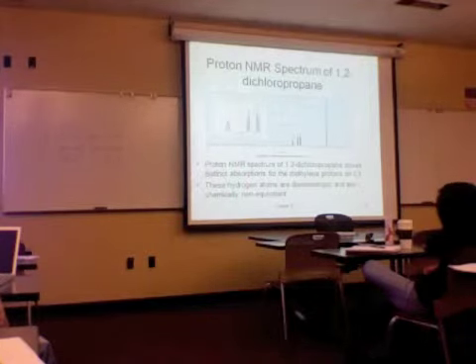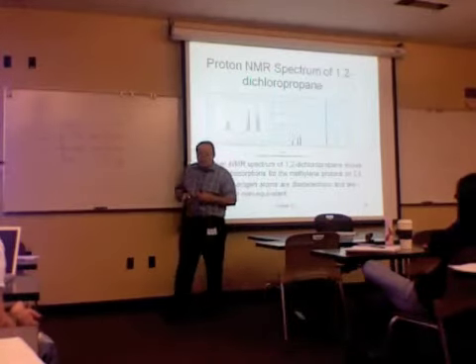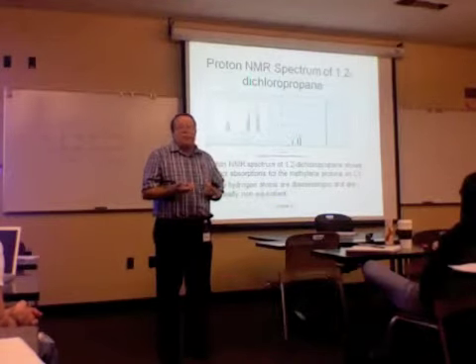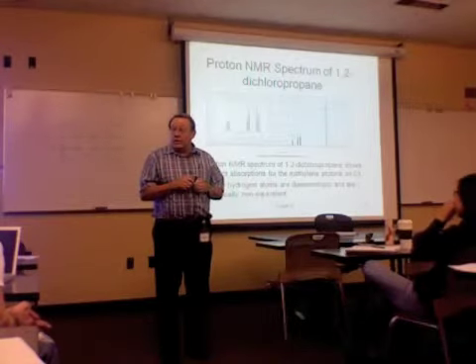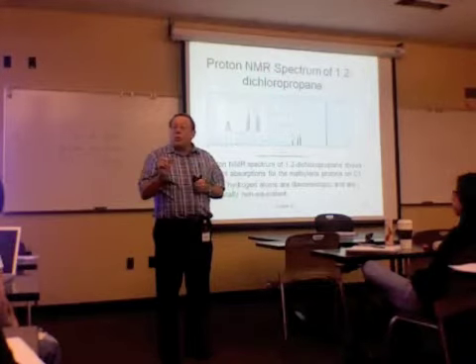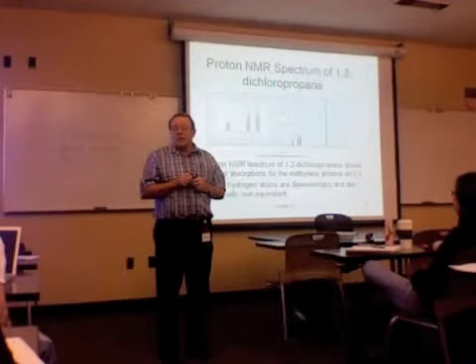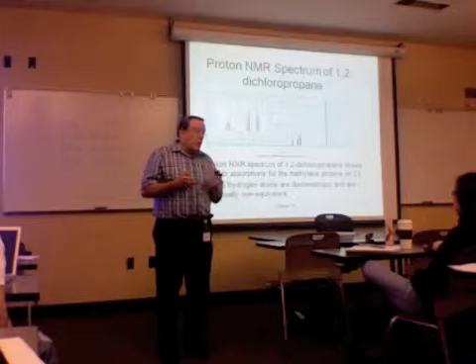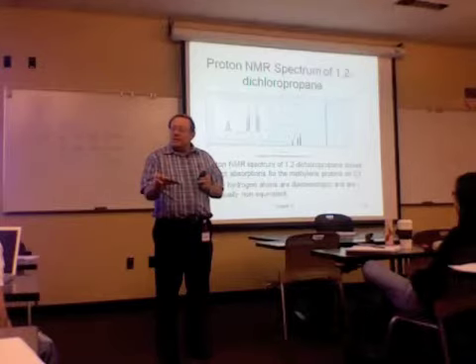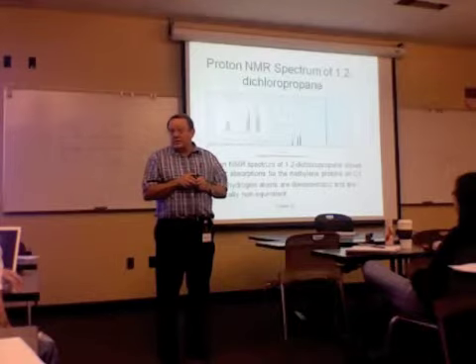Now, the bottom line, because you're not growing up to be spectroscopists, is that if you see complex splitting, almost always it suggests this scenario: either a double bond that's creating splitting on splitting, or a chiral center at the heart of the molecule. Does that make sense? Even though it might be difficult, particularly with low quality instrumentation, to actually pull it apart this way, you should be able to look at that and say, this looks messy because I know there's a chiral carbon next door. Does that make sense?